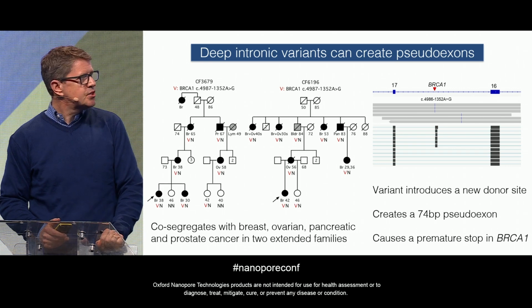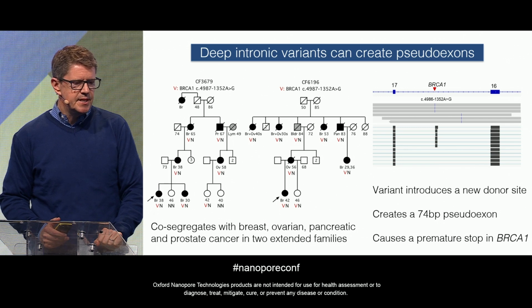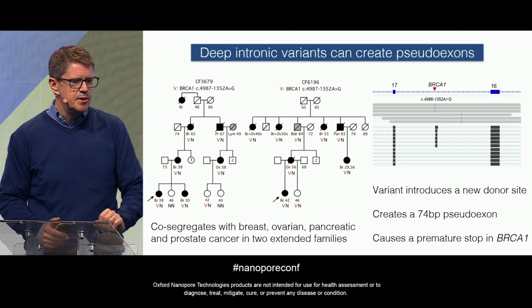I'm now going to show you a bunch of figures that are set up like this, with the gene structure on the top, our long-read genomic DNA reads underneath, showing the variant detection, and then our cDNA long reads showing the gene expression for this particular region.